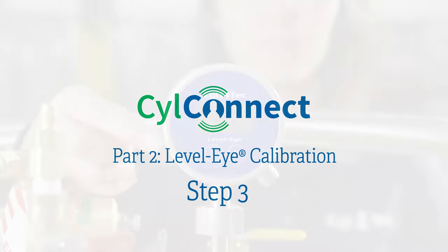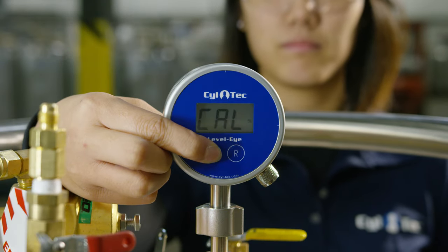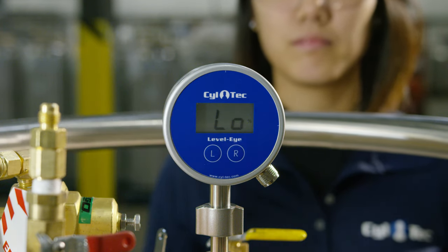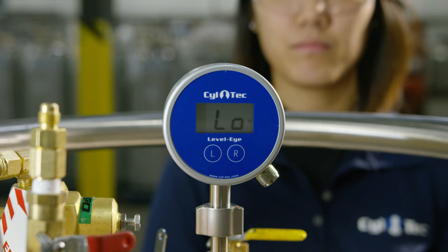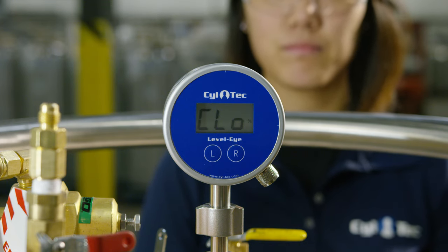Step three: to perform a low calibration, while CAL is displayed, hold down the L button until L is displayed. Release the button and wait for C-Low to display, confirming that the low calibration is complete.